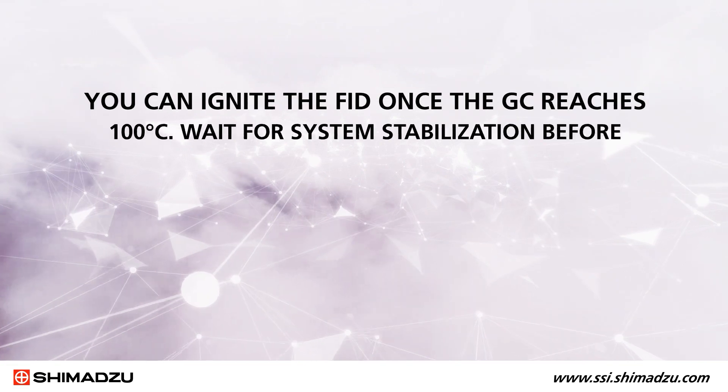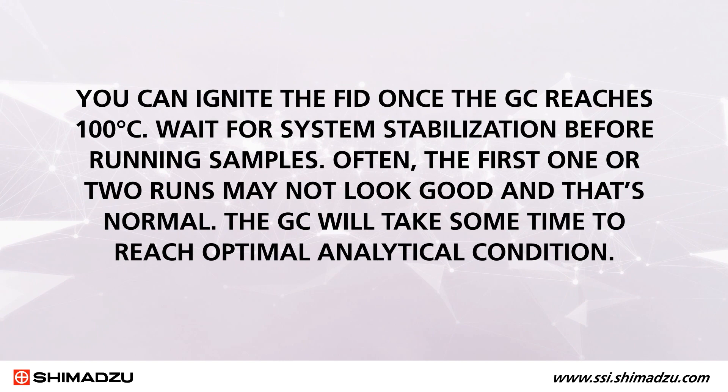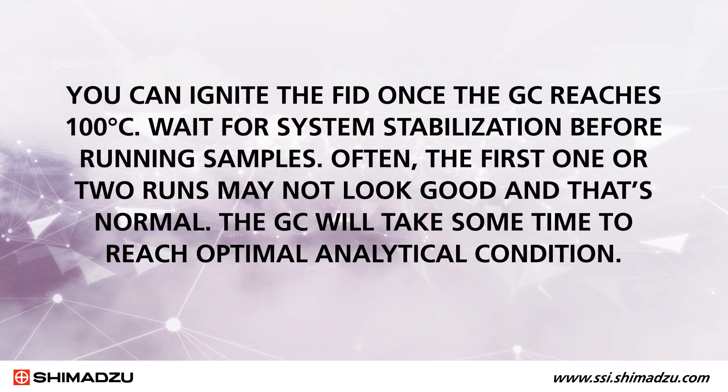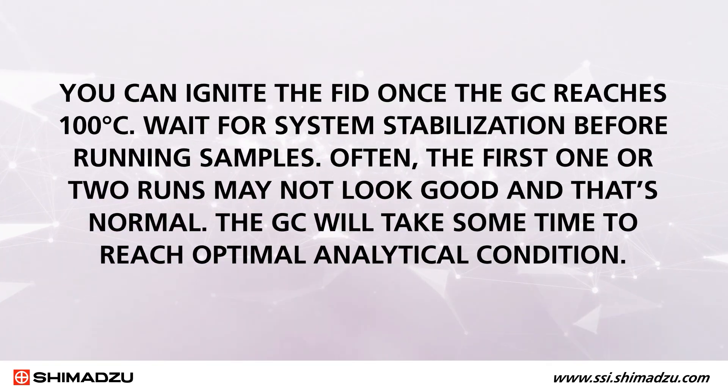You can ignite the FID once the GC reaches 100 degrees Celsius. Wait for system stabilization before running samples. Often, the first one or two runs may not look good, and that's normal. The GC will take some time to reach optimal analytical condition.